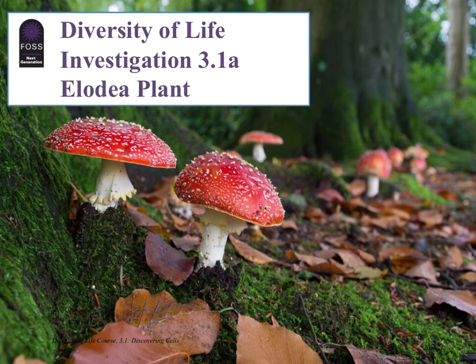Diversity of Life Investigation 3.1a, the Elodea plant.